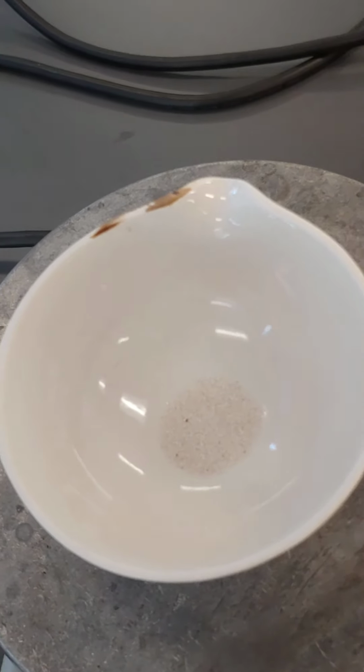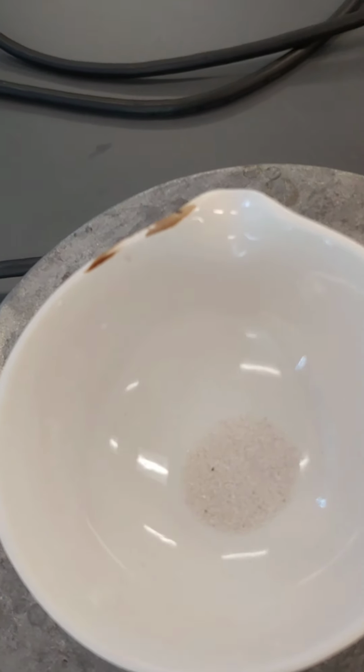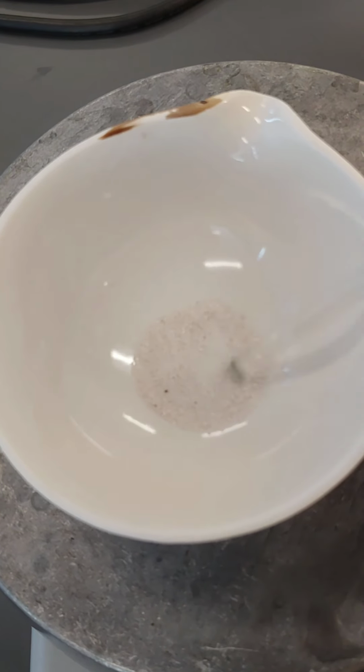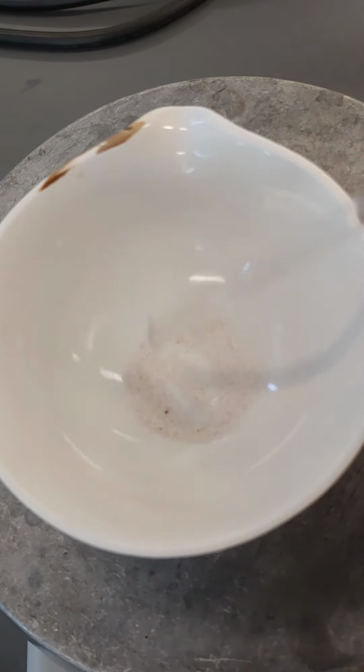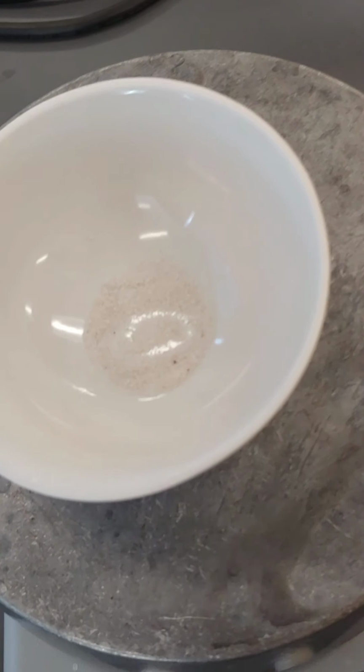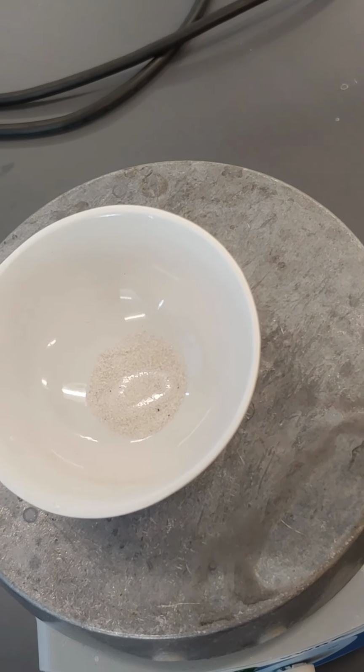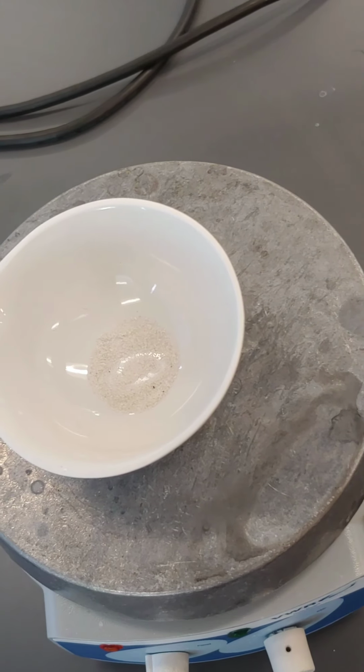You can see the progress that's being made. Here is my sand, which now looks a lot drier. You can see that it's a little more free-flowing, right? Wet sand tends to clump together. Dry sand tends to flow a little easier. It's not sticking to the end of the glass stirring rod, so we know it's a little more dry.